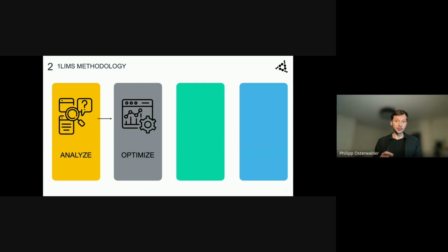A digitalization project in that specific case is not determined by a timeline. Digitalization and the overall term of transformation is not within a time frame and doesn't have a specific goal. We can create milestones and we have to define milestones, but it starts by wanting a change.